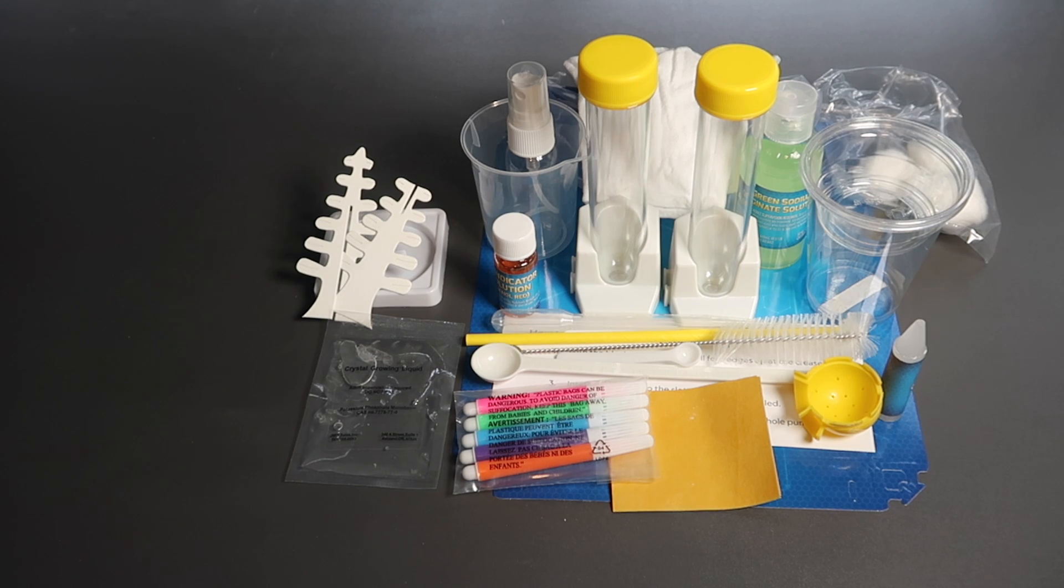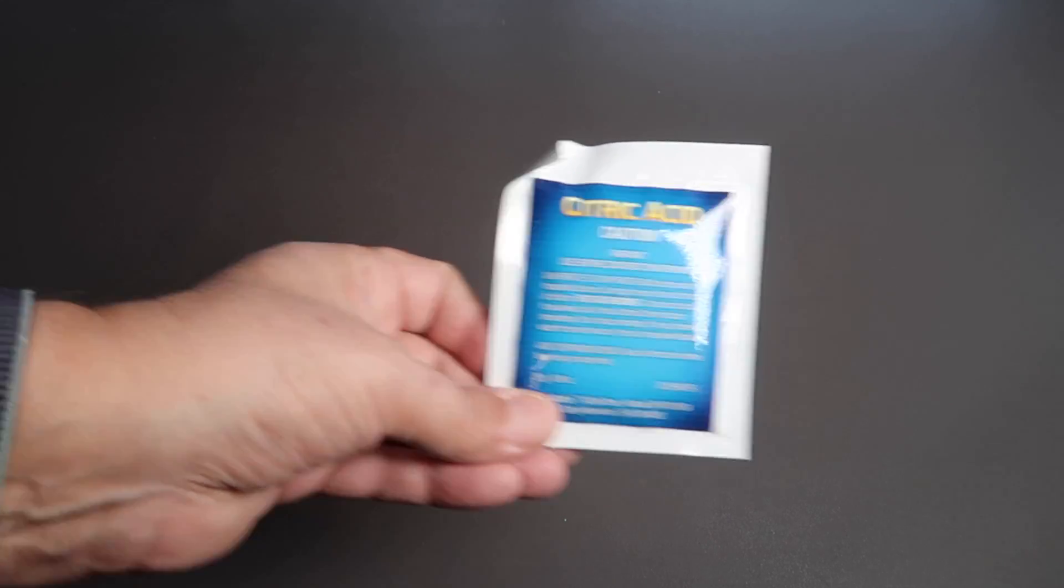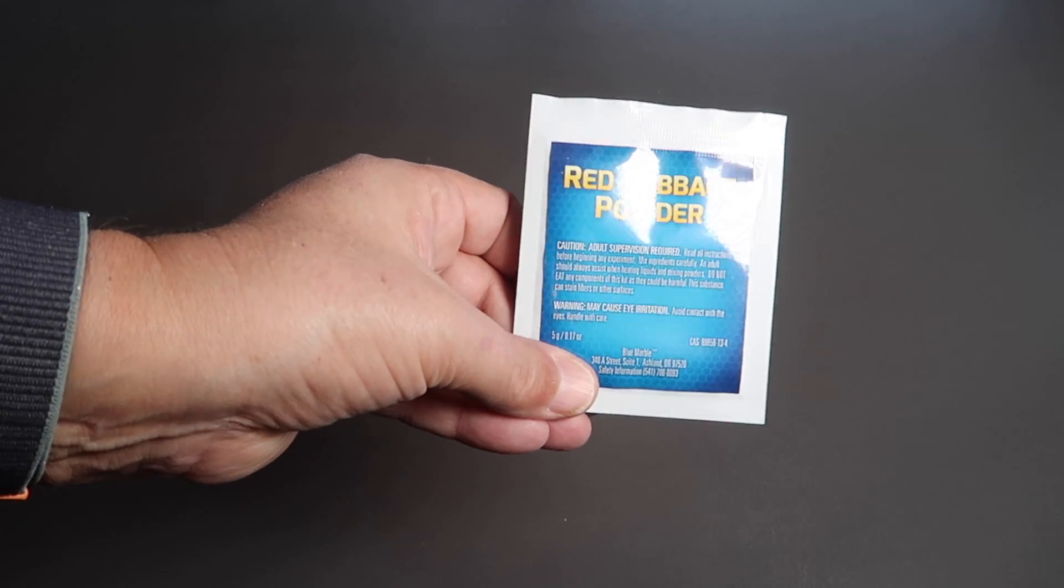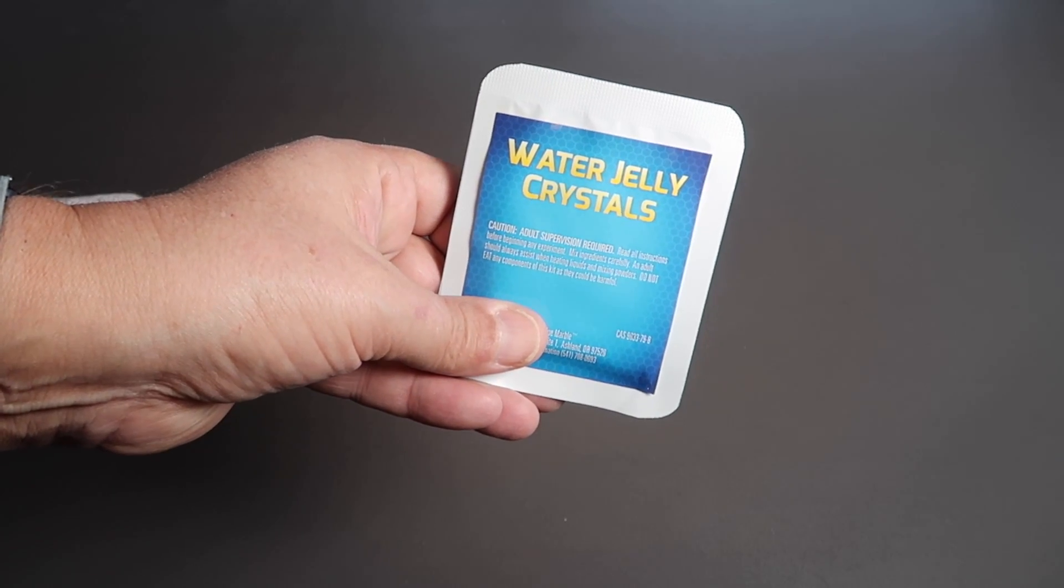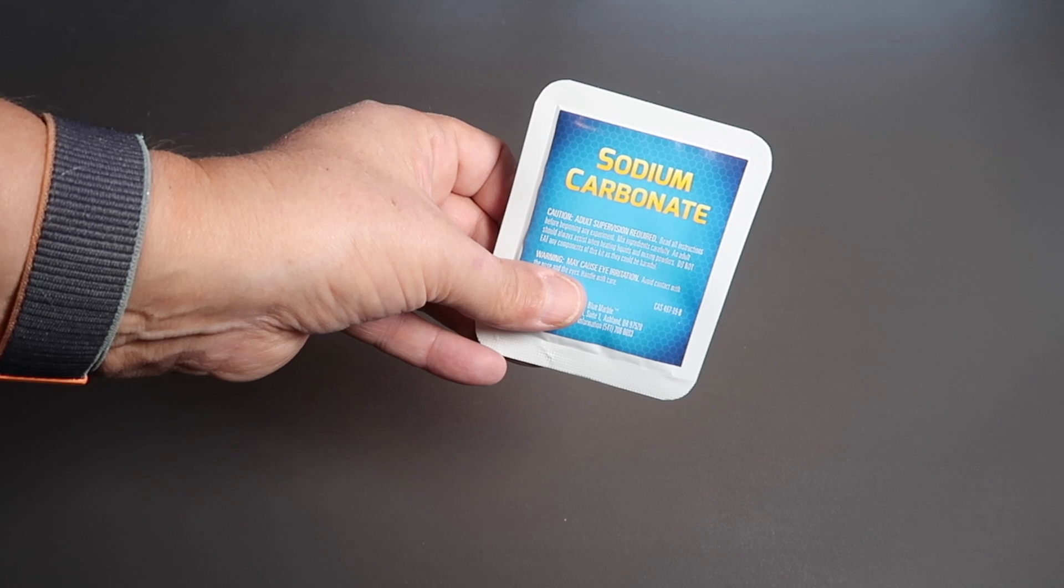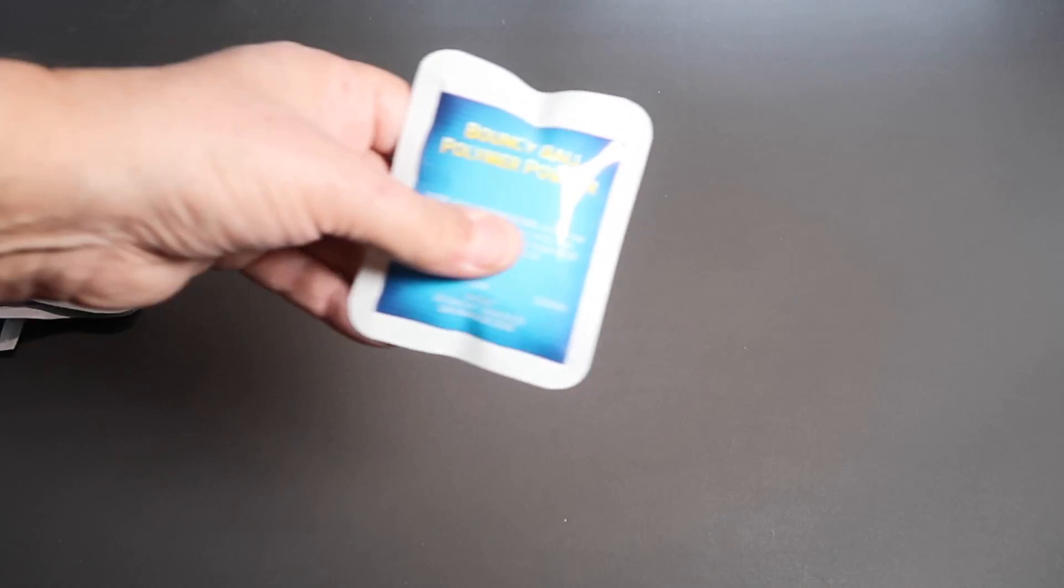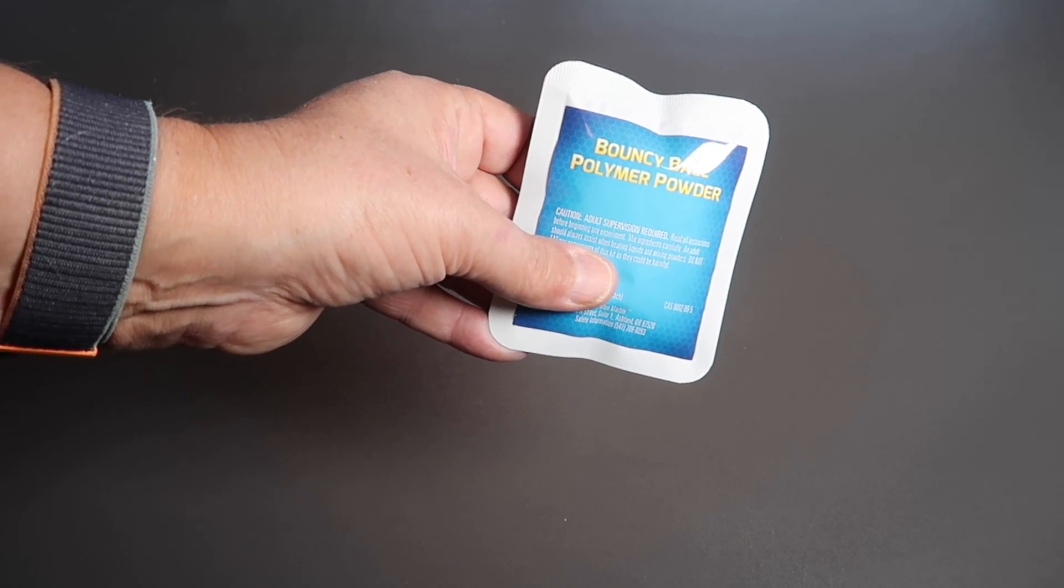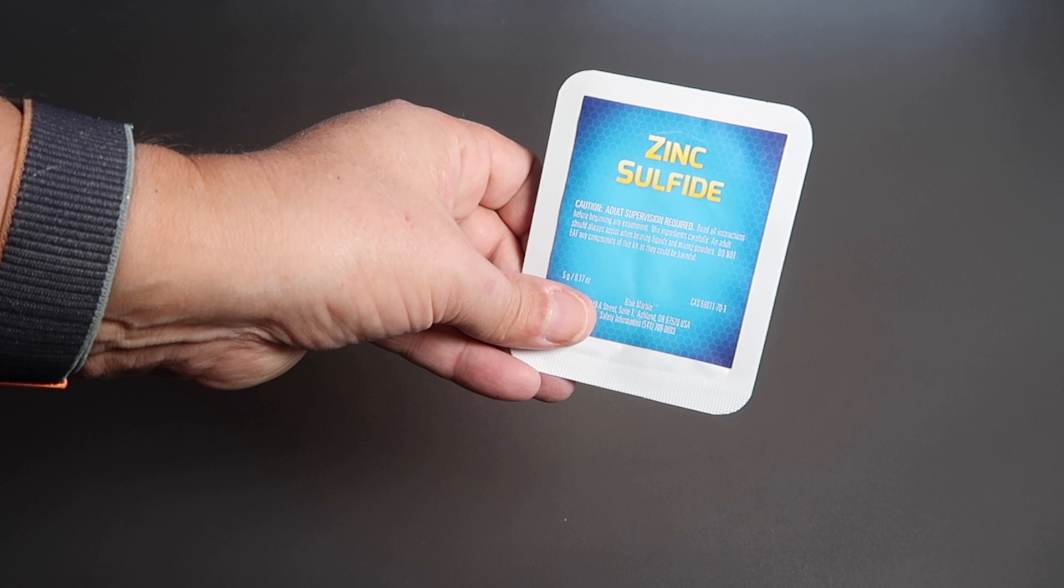And finally, we have a whole bunch of chemicals. Citric acid, red cabbage powder, calcium chloride, water jelly crystals, baking soda sodium bicarbonate, fizzy coloring tablets, sodium carbonate, bouncy ball polymer powder, and zinc sulfide.